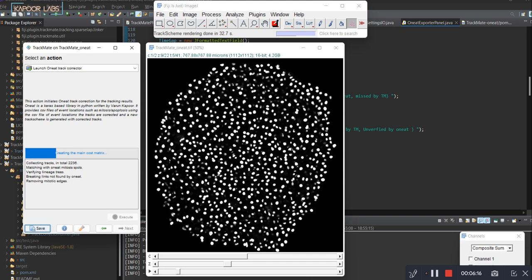So it only sees those track segments and can only link with them. So it's kind of like solving the segment to segment linking problem locally, rather than solving a global optimization problem, because it makes sense here as we know the information about mitotic cell location, so we have to leverage that information by forcing the solver to find the proper links based on minimizing this cost matrix locally.